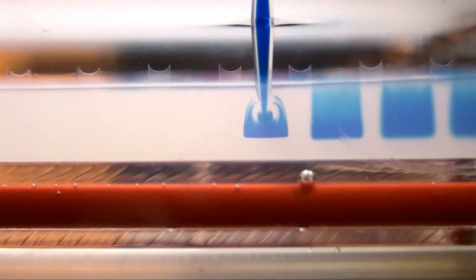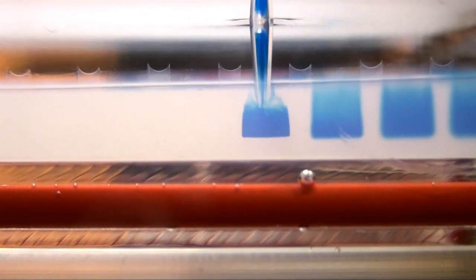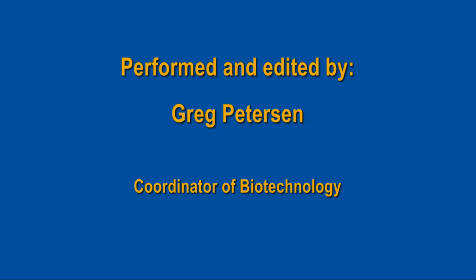Last but not least, here is a quick example of what happens when you do not remove the tip before you pull the plunger back up. You will load some of your sample back into the tip. This may not be a big deal, but if you are trying to be quantitative, it may lead to false results.